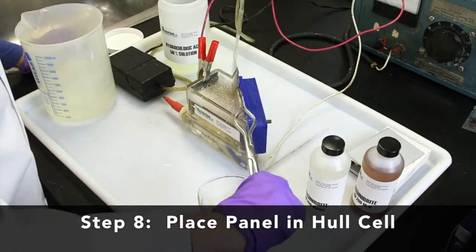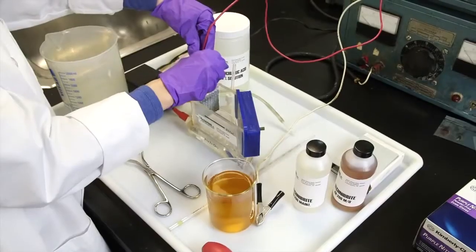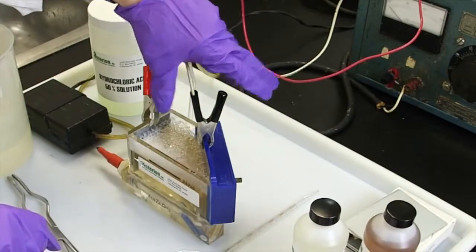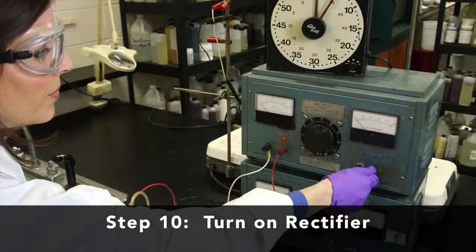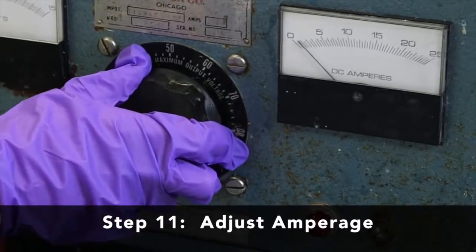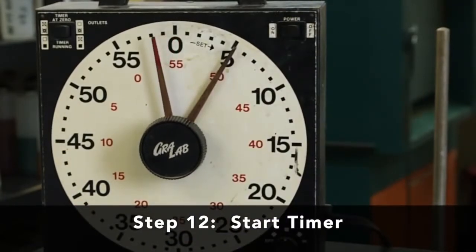Place the panel in the Hull cell and connect the electrical connections — clamps and leads corresponding to the correct polarity: positive to the anode, negative to the cathode or panel. Set the timer to the correct time; here we have chosen five minutes. Turn on the rectifier or power source and adjust the amperage to the desired level — here we've chosen two amps. Start the timer.